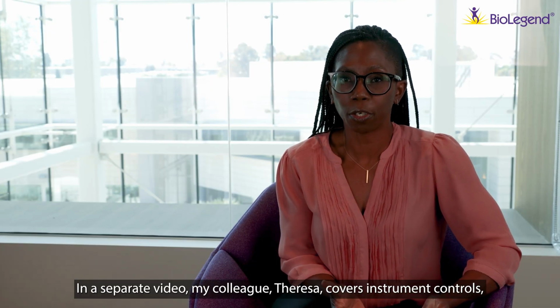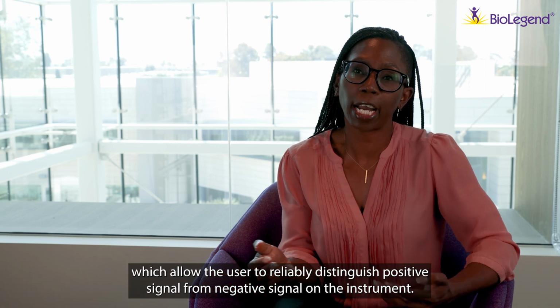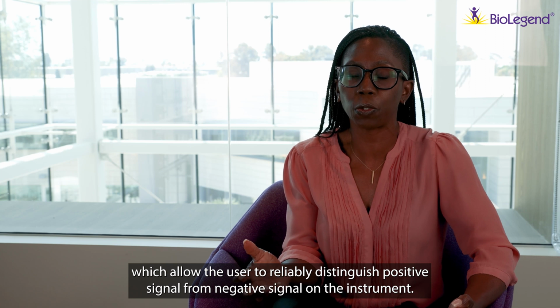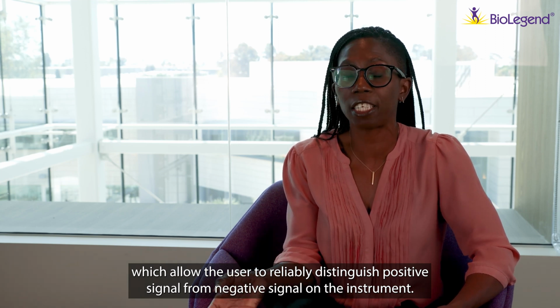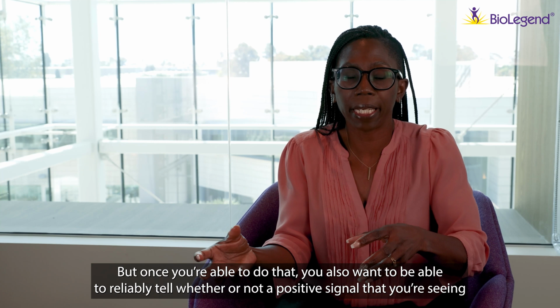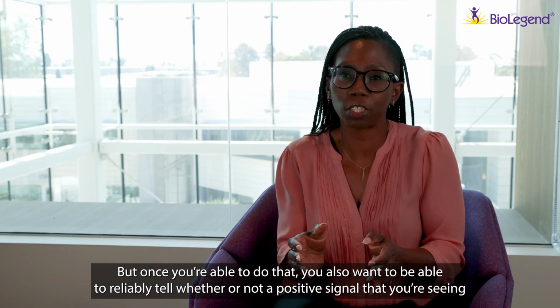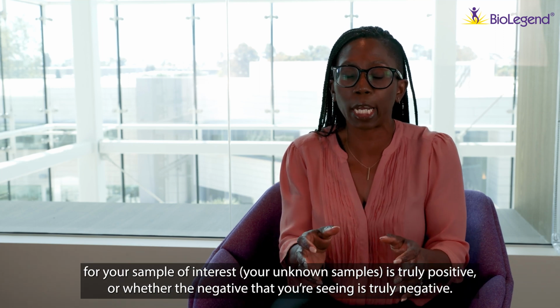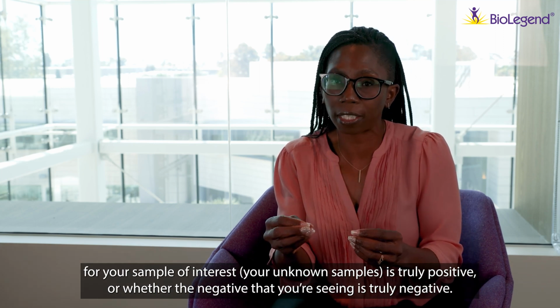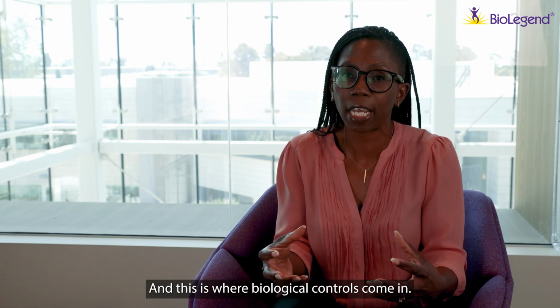So in a separate video, my colleague Teresa covers instrument controls, which allow the user to reliably distinguish positive signal from negative signal on the instrument. But once you're able to do that, you also want to be able to reliably tell whether the positive signal that you're seeing for your unknown samples is truly positive, or whether the negative that you're seeing is truly negative. And this is where biological controls come in.